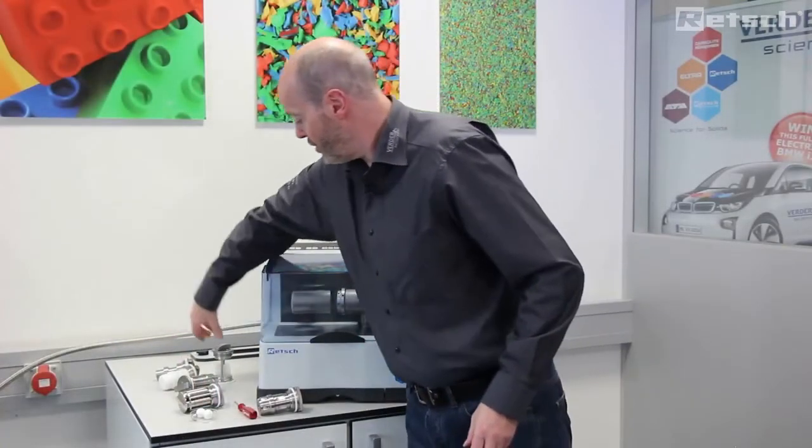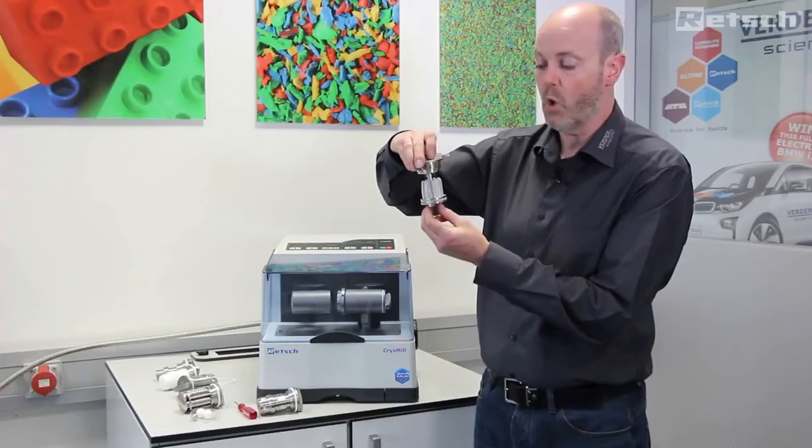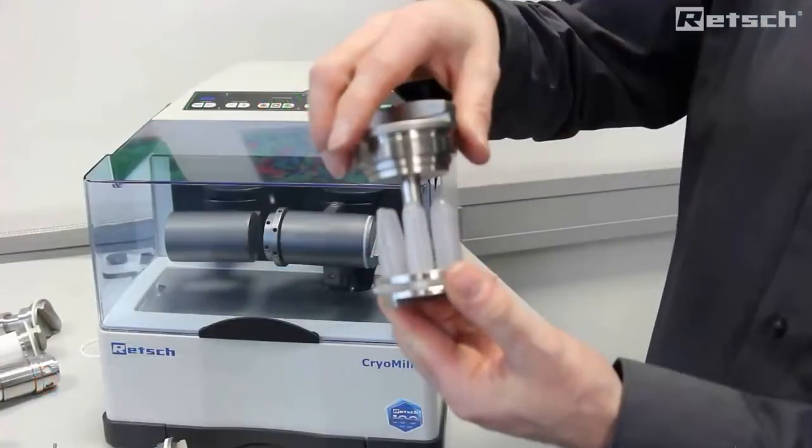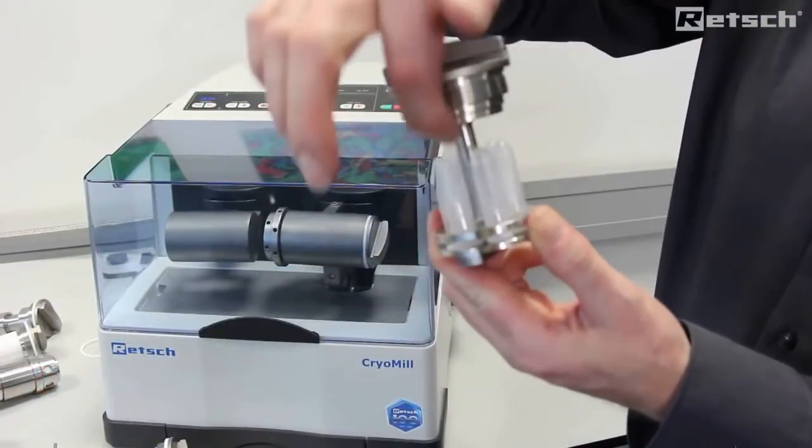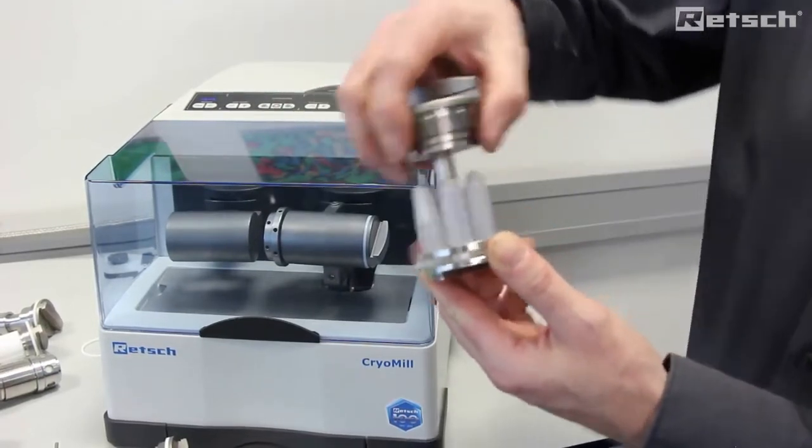If the client wishes to work in either 1.5 milliliter tapered end or 2 milliliter round-bottomed Eppendorf tubes for life science applications, we can also accommodate this with a further adapter.